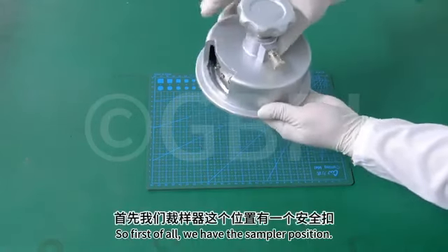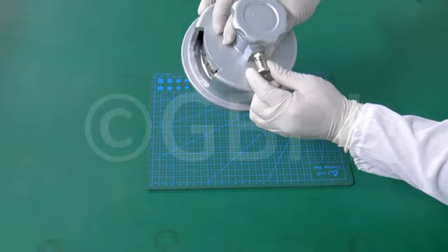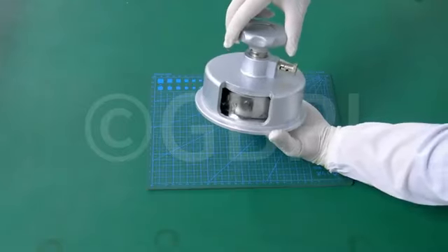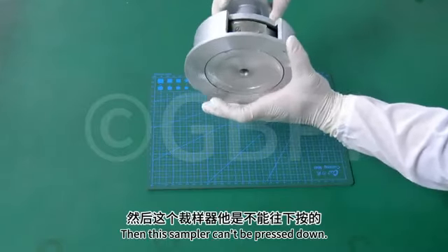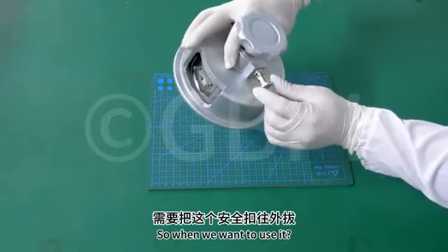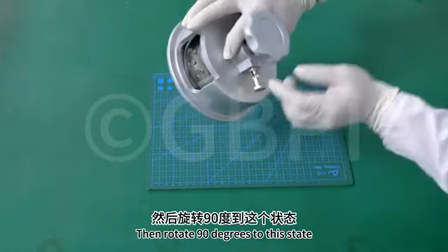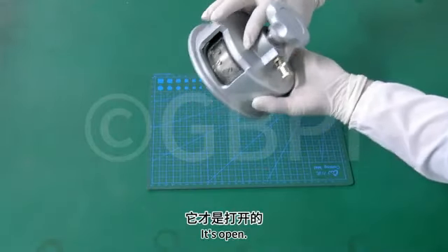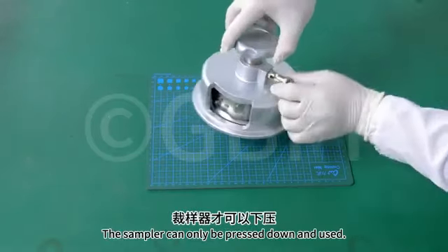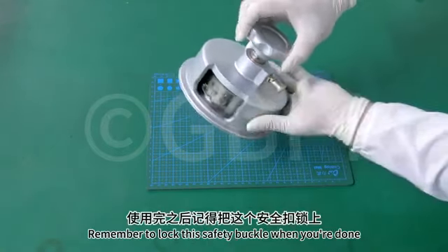So first of all, we have the sampler position. There is a safety buckle. When the safety buckle is locked, then this sampler can't be pressed down. So when we want to use it, you need to pull this safety buckle out. Then rotate 90 degrees to this state. It's open. This is when we sample. The sampler can only be pressed down and used. Remember to lock this safety buckle when you're done.